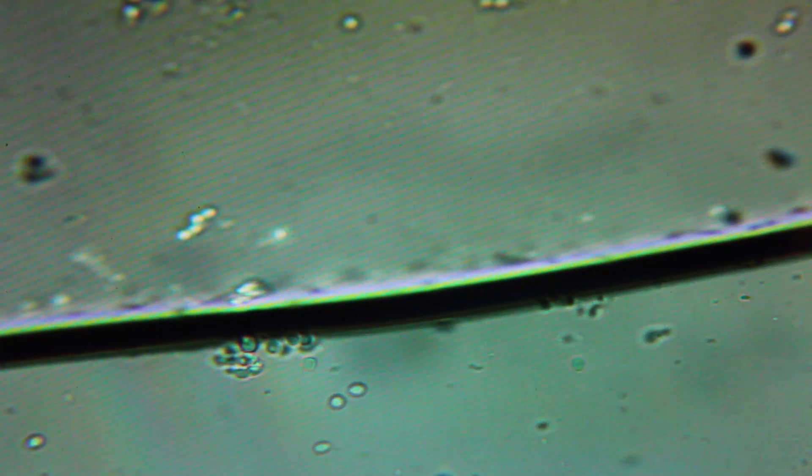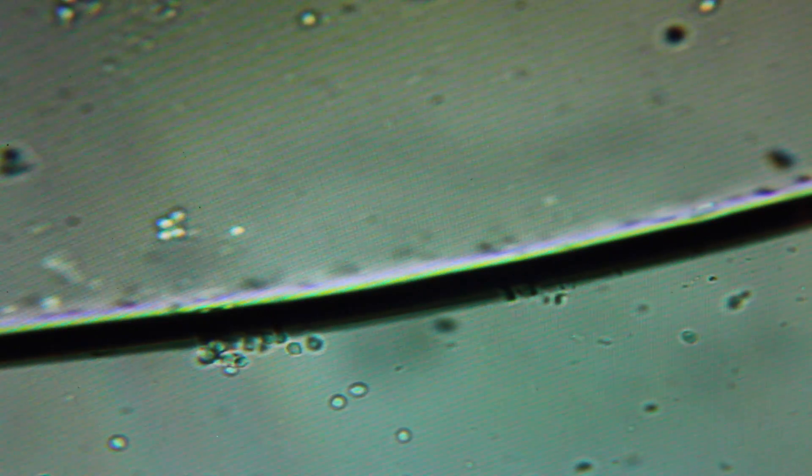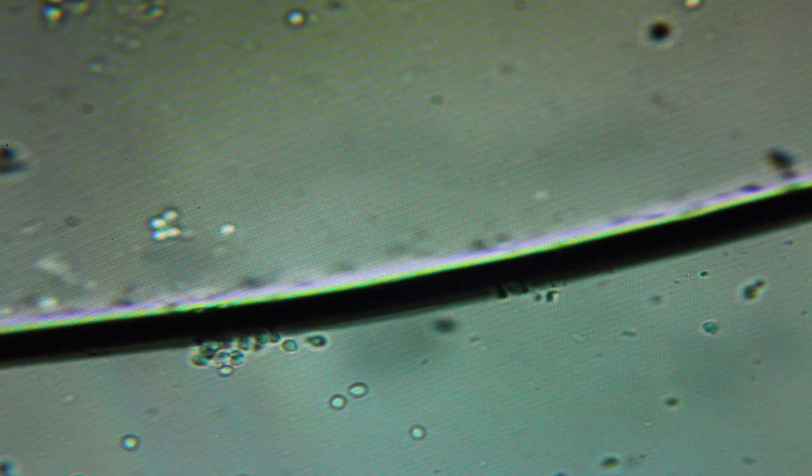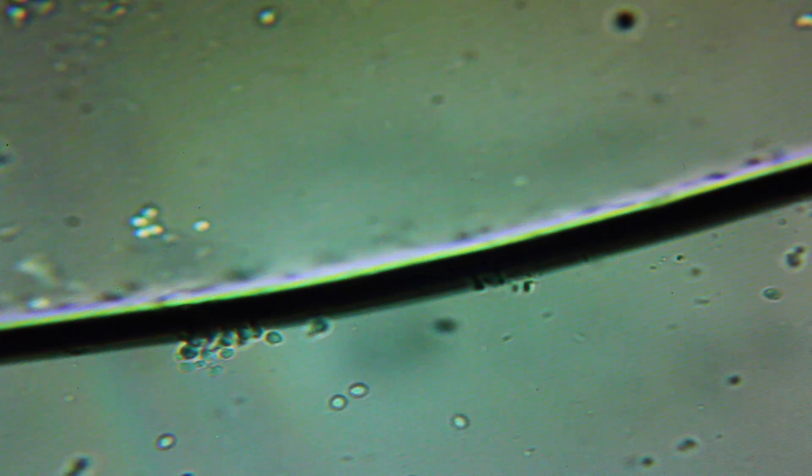This is because the upper half of the slide, above the black line, has live cells from the back of a throat containing strep and staph. As those cells come across the silver moving across the slide, you can see they're becoming dead. In other words, silver kills on contact.